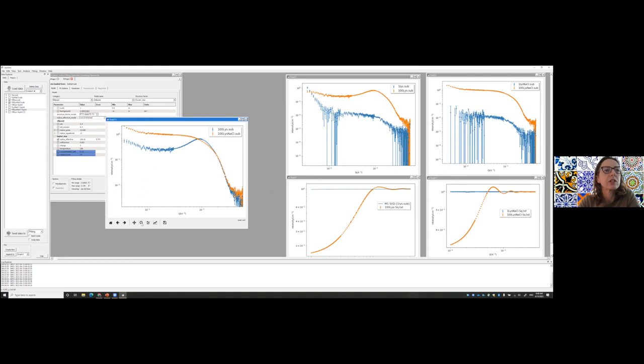And you can also change how you display it. You can save the data as well. You have different options there that are not shown by default. In the older versions, this little option for the navigation menu pops up automatically, but on the more recent versions, not necessarily.